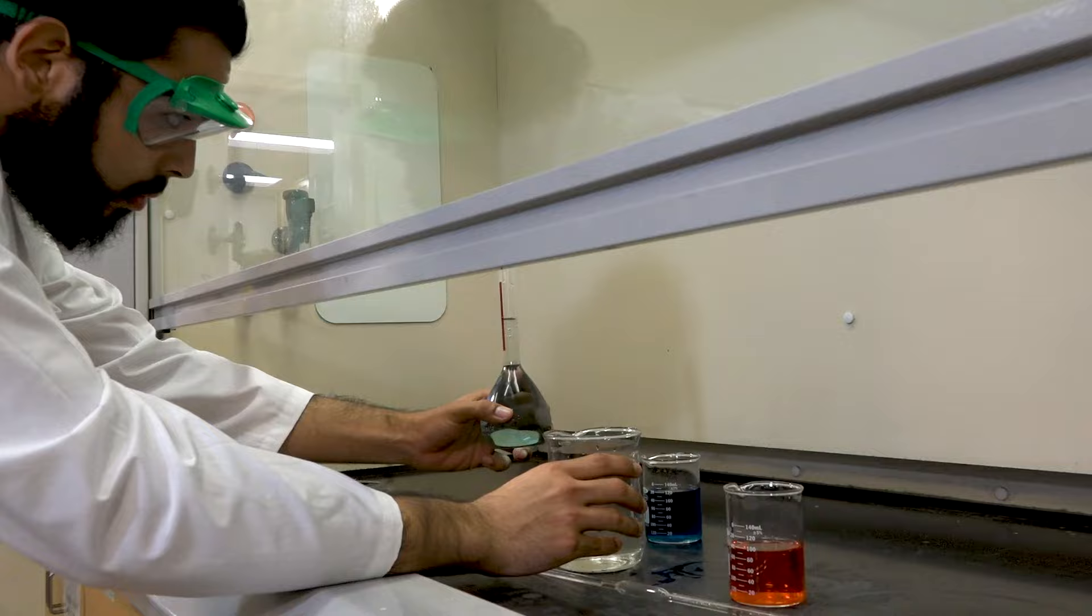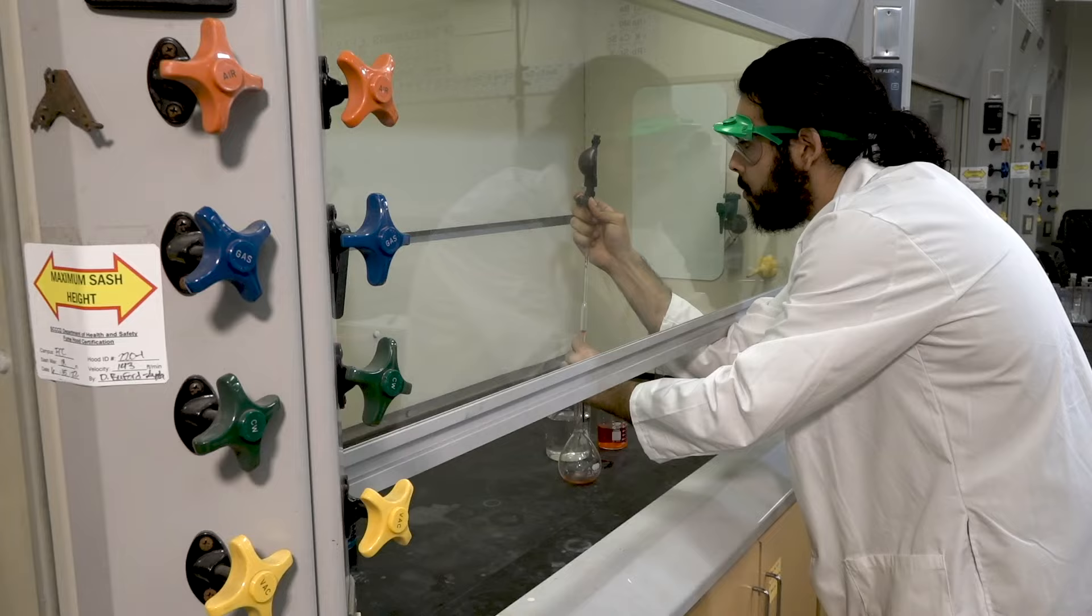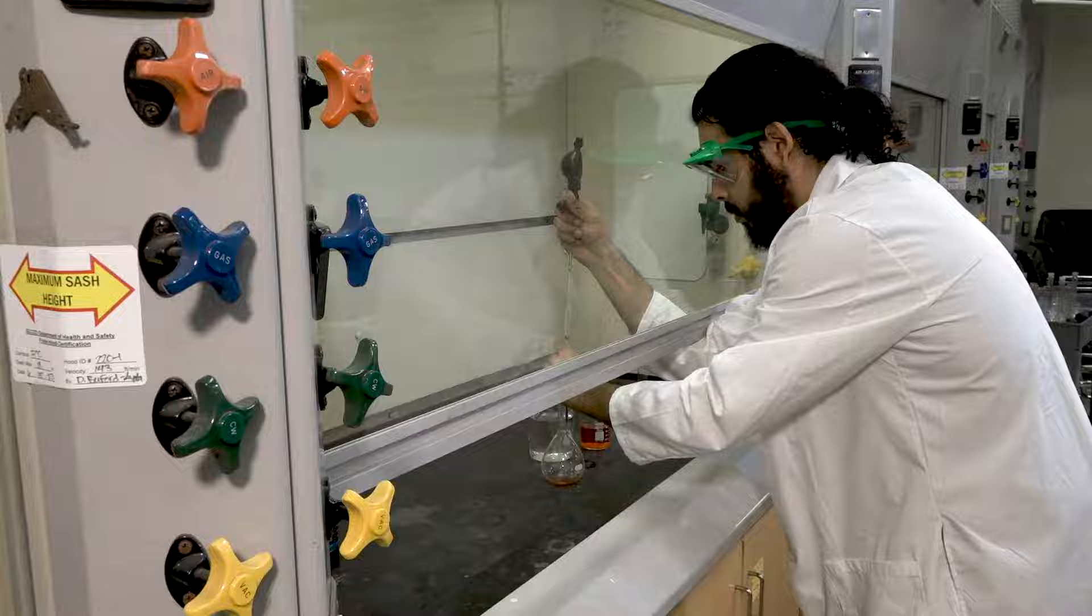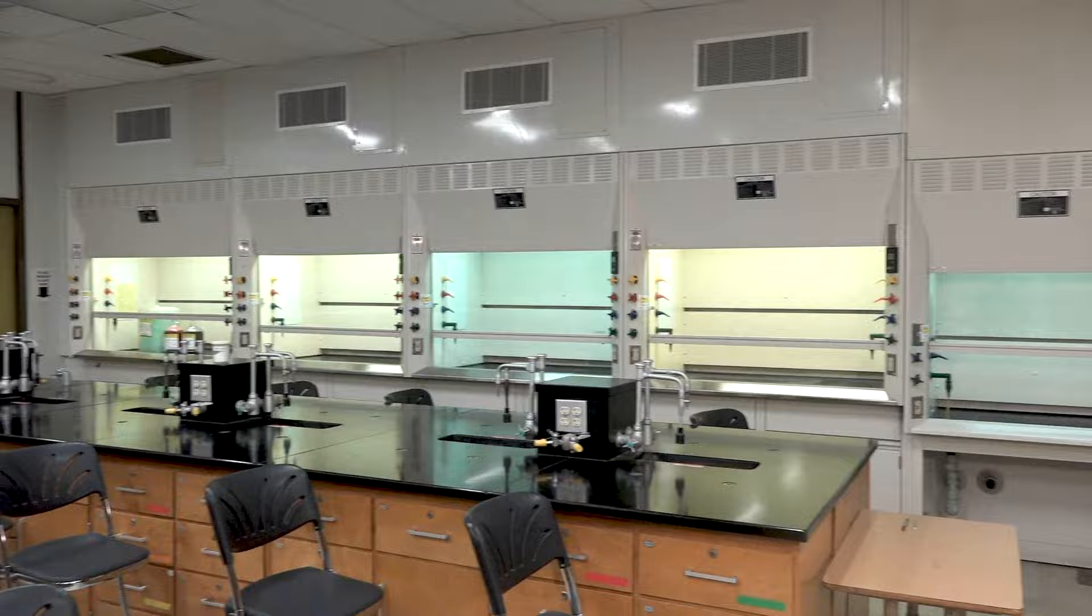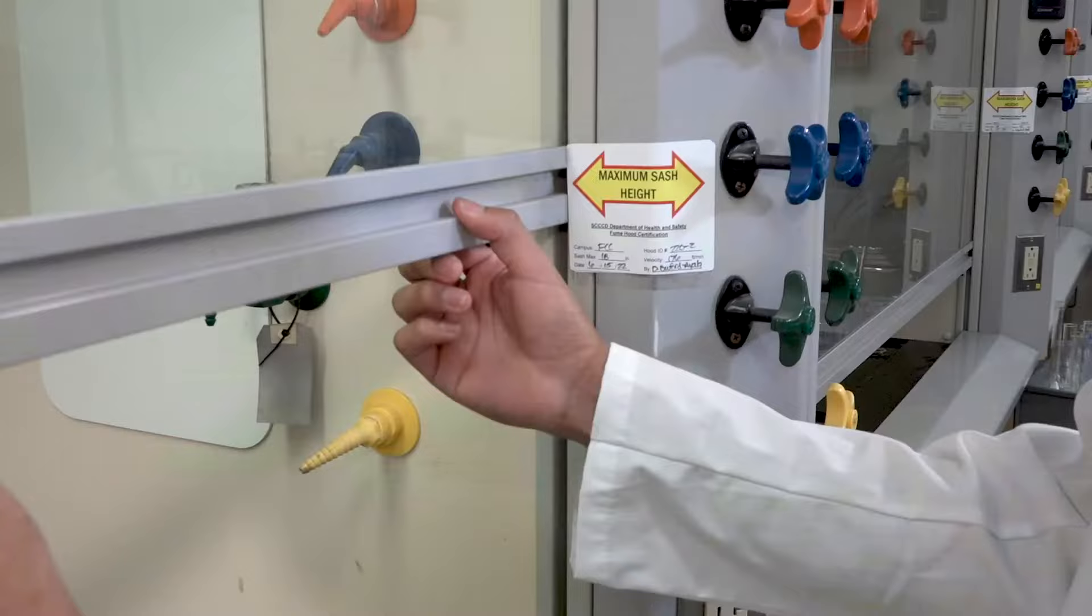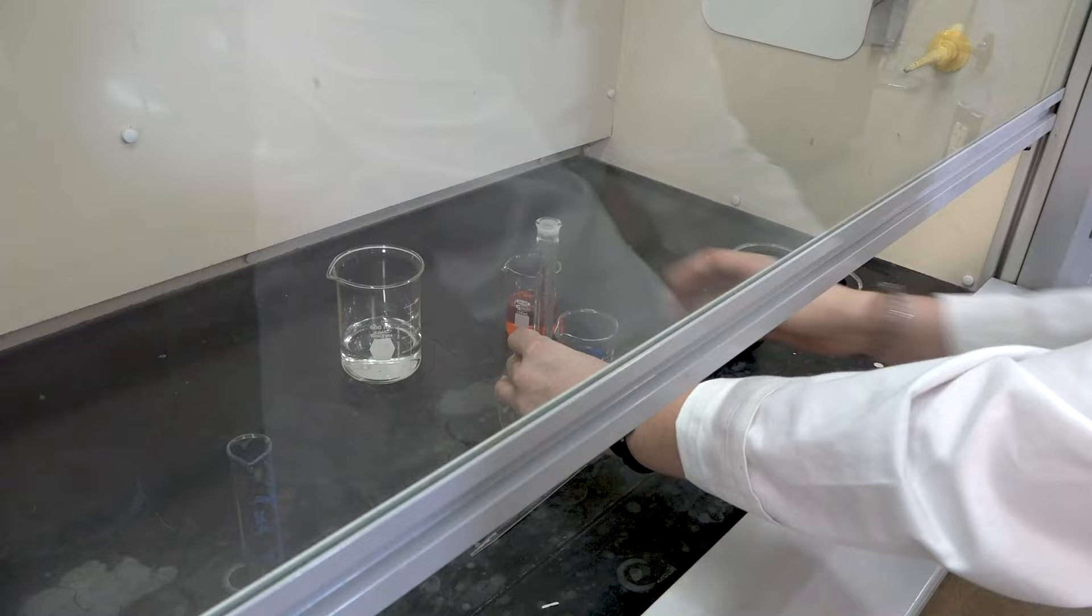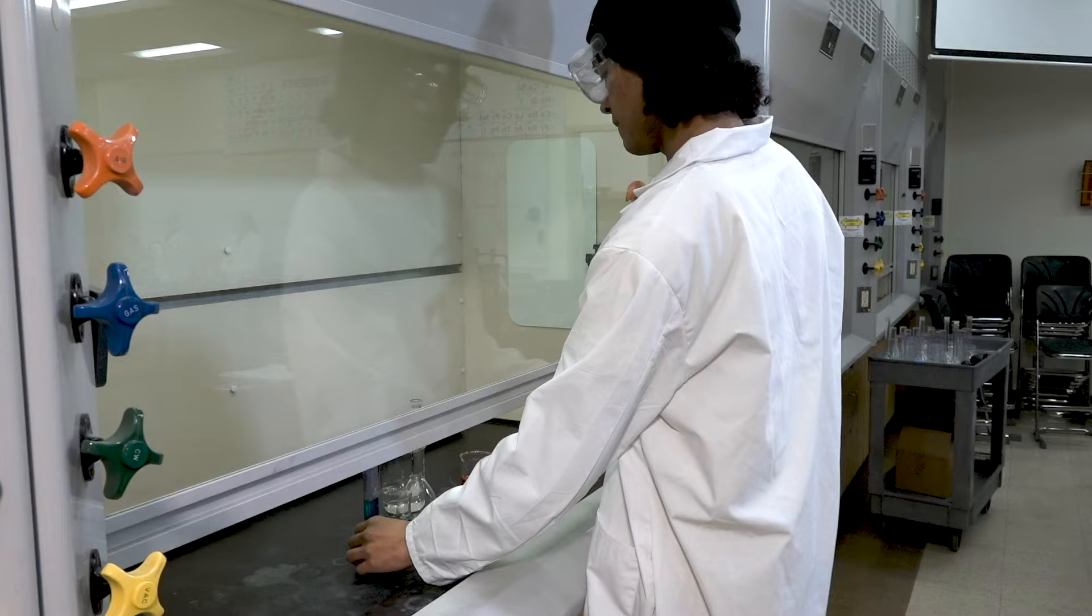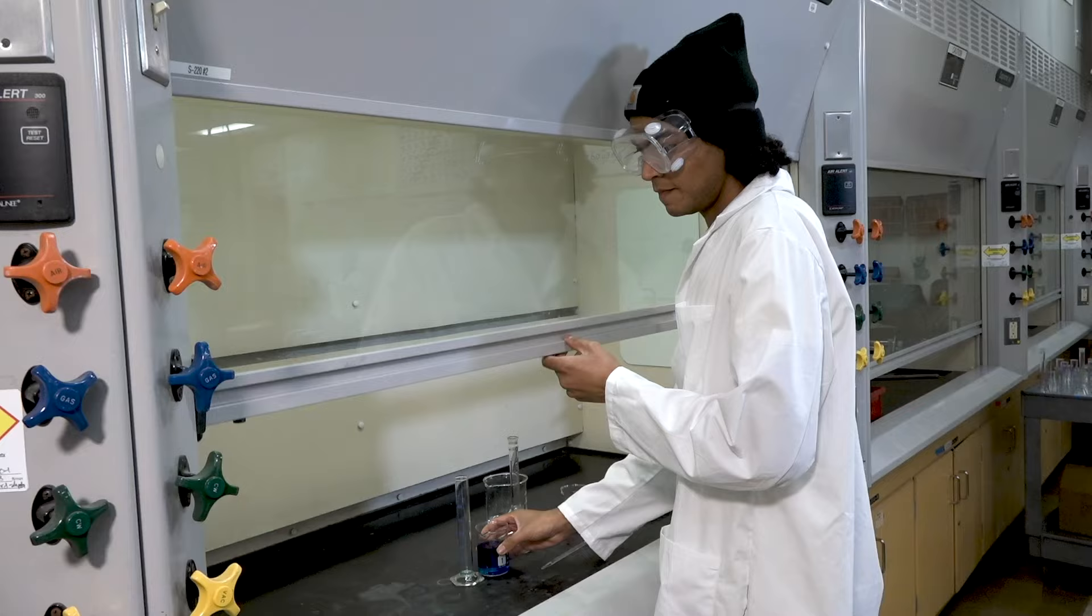Some chemicals, especially those encountered in an organic chemistry lab, can give off vapors that are hazardous to our health. When working with such substances, it is important to use the fume hood. The fume hood applies a vacuum that draws up dangerous vapors away from the researcher. In order to ensure an adequate vacuum, the doors to the hood must be kept only slightly open. When working in a fume hood, only your arms should extend into the hood, while you view your work through the glass window on the fume hood door. Never stick your head inside the fume hood, or open the doors fully in order to view your work. The doors are there to protect you.